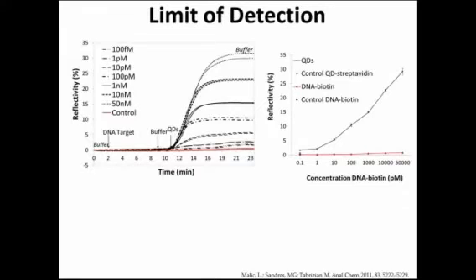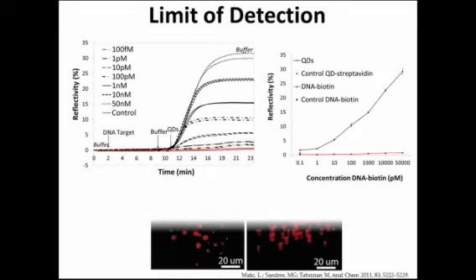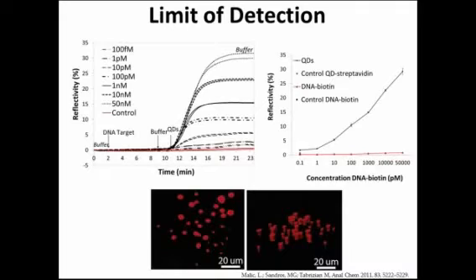Conversely, using the quantum dot amplification strategy, an improvement of more than 6 orders of magnitude in limit of detection and 25-fold signal enhancement is obtained. The minimal DNA concentration corresponded to 100 femtomolar after an 8-minute hybridization reaction time. In addition, the use of quantum dots provided the means, without any additional surface treatment, to combine SPRi technology with fluorescence imaging. At the bottom, you see 3D images of the DNA sandwich assay biochip surface, reconstructed from Z-sectional images and loaded into Imaris 6.3 imaging software.